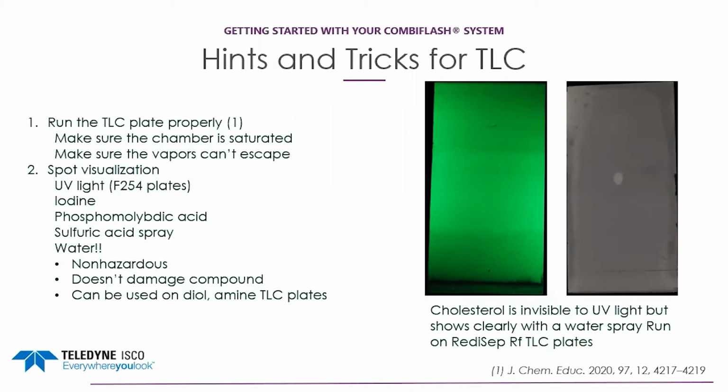Water spray works because most compounds are hydrophobic and protect the silica from being wet. The wet silica is gray while the dry silica is white. This is a good technique for other TLC plates such as diol and amine, which react with the oxidizing indicators such as sulfuric acid.